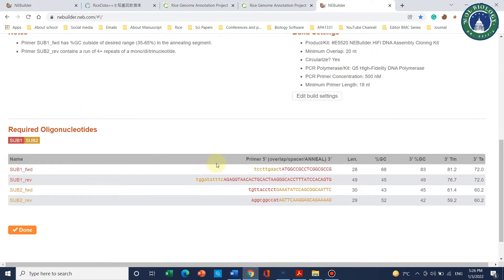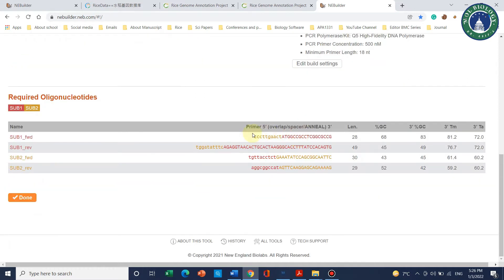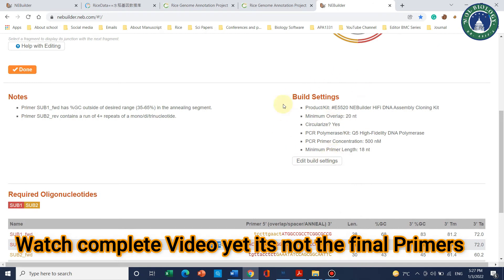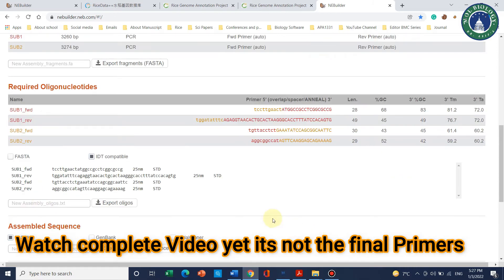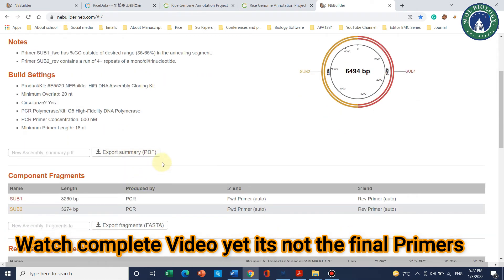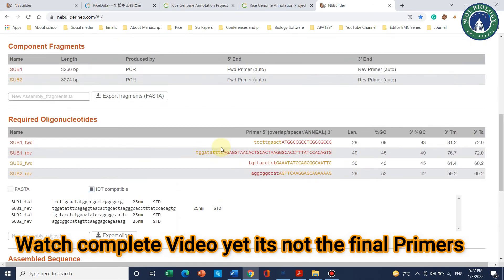Click 'Add' and now four primers have been designed automatically by the software. The good thing is that the software will automatically generate overhangs for the forward and reverse primers, so that later you can individually clone each fragment and then link them together using these overhangs. We can also click on 'Build Settings' to edit settings, then click 'Done'.